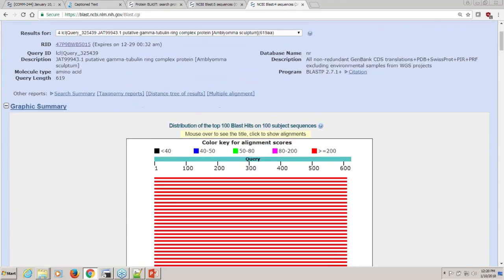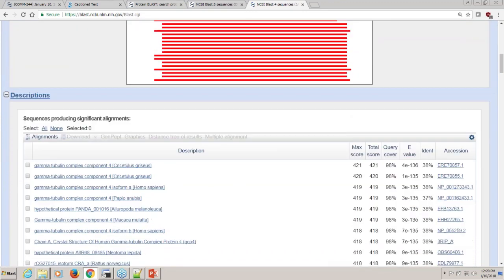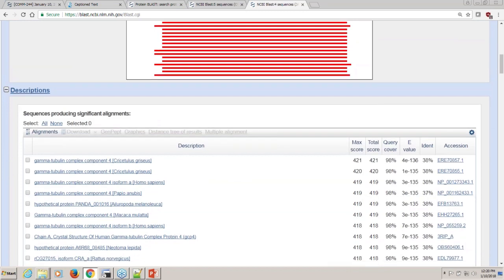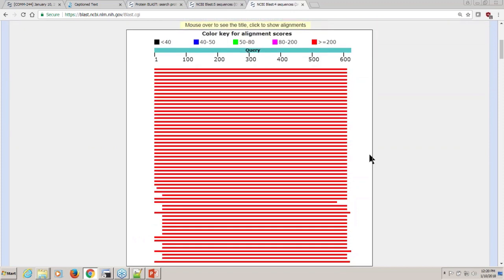Remember, this protein found that match in QuickBLASTP was 1 match. Actually, this finds lots of good matches that are highly significant when you're using BLASTP. So just be careful when you're looking at a low percent identity. You don't really want to be using the QuickBLASTP, but it works great if your sequences are very similar to each other. Or they have lots of examples of themselves in the database is maybe another way of putting that.